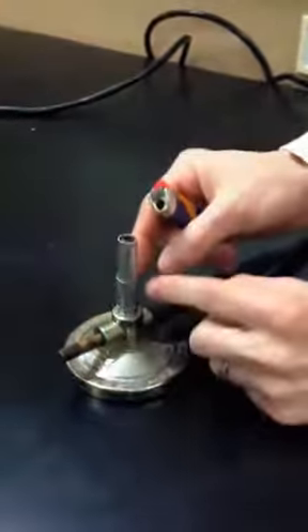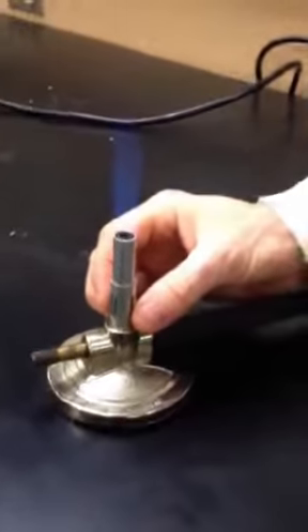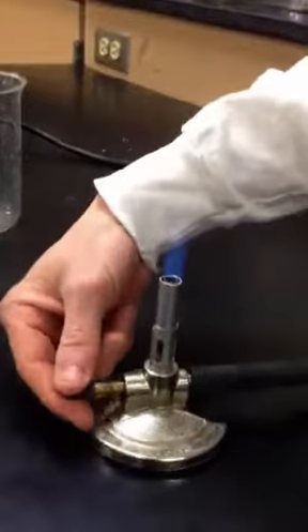Make sure the valve is shut, light it, and then you can open up the valve to give it some more air to get the double flame going. To shut it off, just turn the knob off and then it has no more gas.